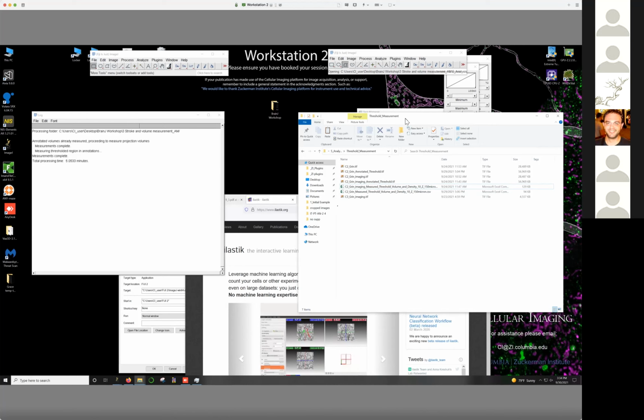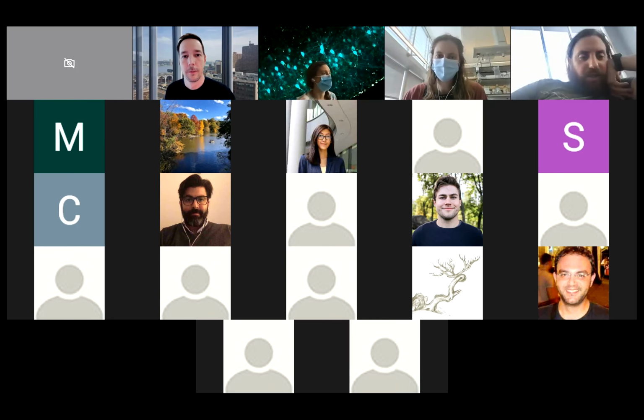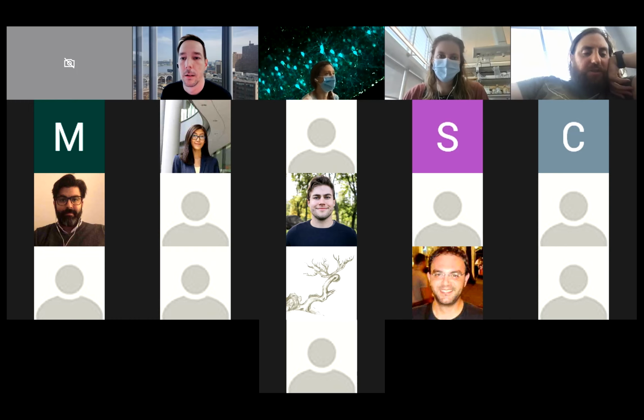So, are there any questions or anything you want to ask? Yeah, I have a few questions. One was, how can it deal with a hemi section if you just have half a brain, or do you need to duplicate it and flip it and recreate a full section?